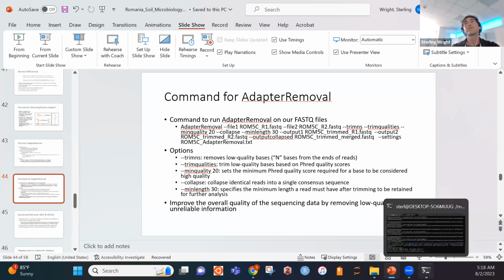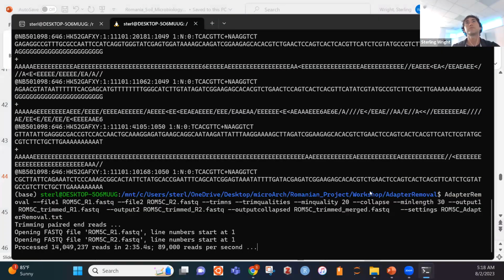So everyone must be following along perfectly, not coming into any troubles. Looks like it's almost there. It's over 14 million, over 15 million.